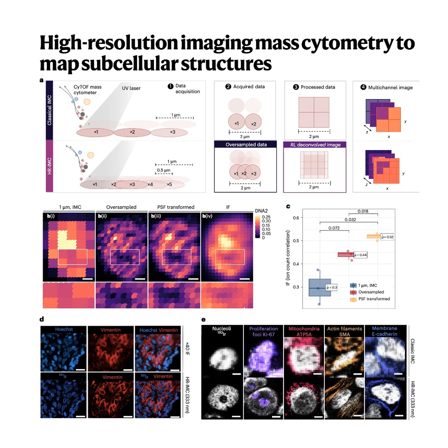They're saying this specific cluster of pixels representing a mitochondrial region is defined by high ATP5A and HSP10. Precisely. And the power is in the enhanced separation. Low-resolution data just mashes all those signals together, but HR-IMC achieved superior separation of these clusters. Cluster 4, for instance, was cleanly defined as a mitochondrial region, and Cluster 8 corresponded exactly to those Ki-67 proliferation foci we discussed earlier. That's it.